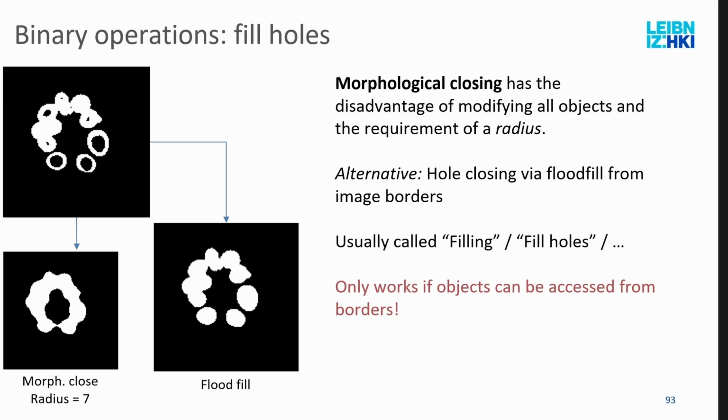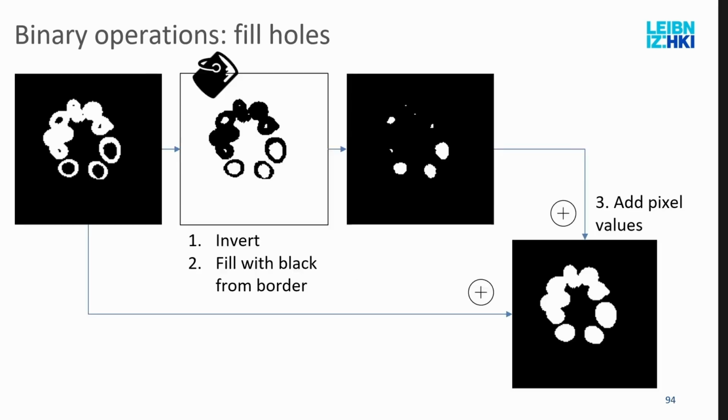The outlines are not changed. So this is basically this flood filling algorithm. It's basically how your MS Paint flood fill works. It first inverts the image, then it starts a flood fill, usually it goes through the border, and then takes everything that is white and flood fills it to black. Looks like that here. And then you have basically the insides of these holes. You just add these images together. Once the holes are not filled, then we have the fillings, boom, solved.